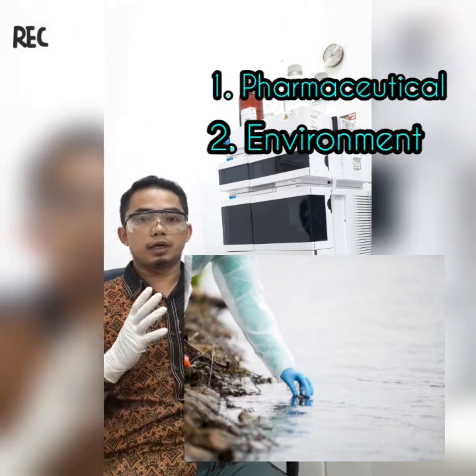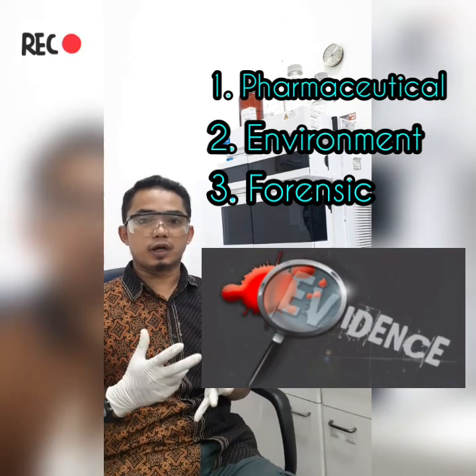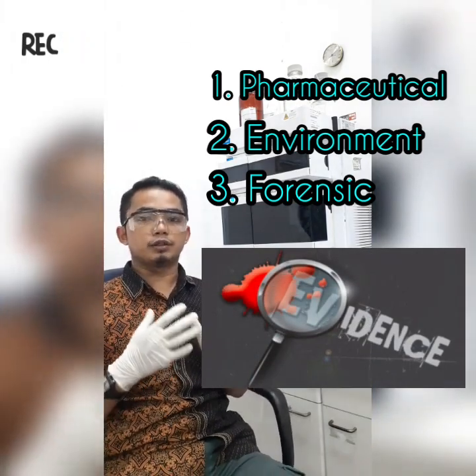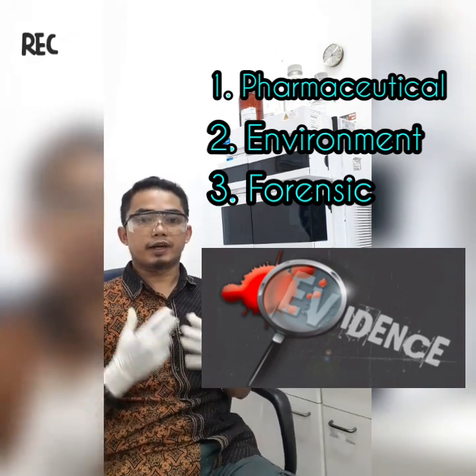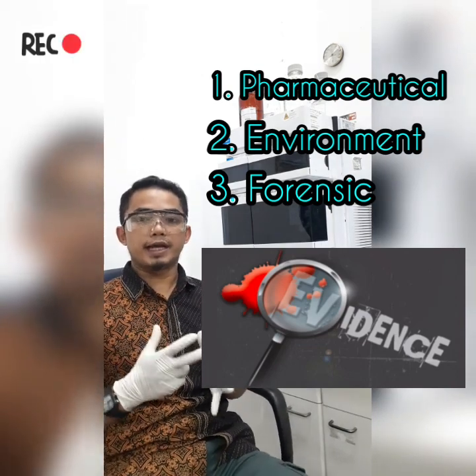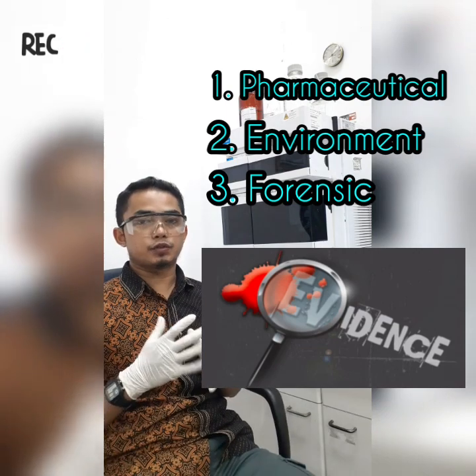The next is application in forensic: quantification of drugs in biological samples, identification of steroid in blood, urine, etc., forensic analysis of textile dyes, and determination of cocaine and other drugs of abuse in blood, urine, etc.